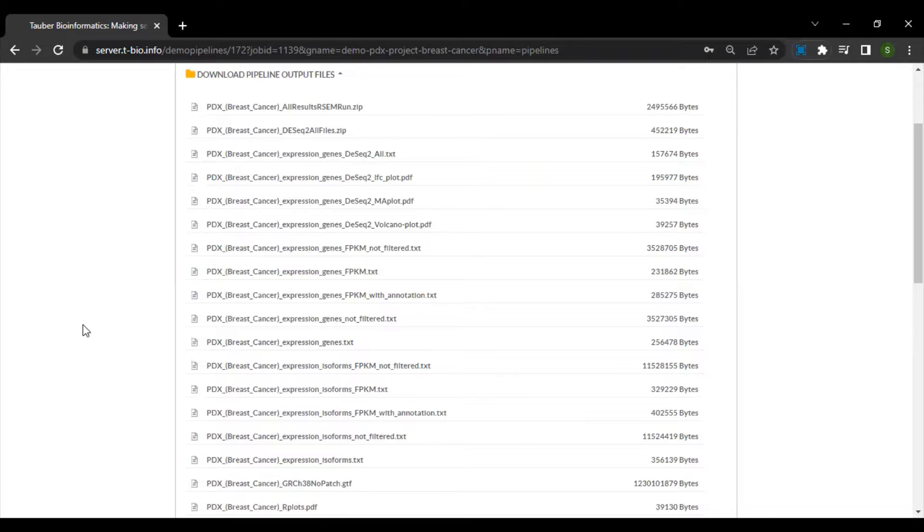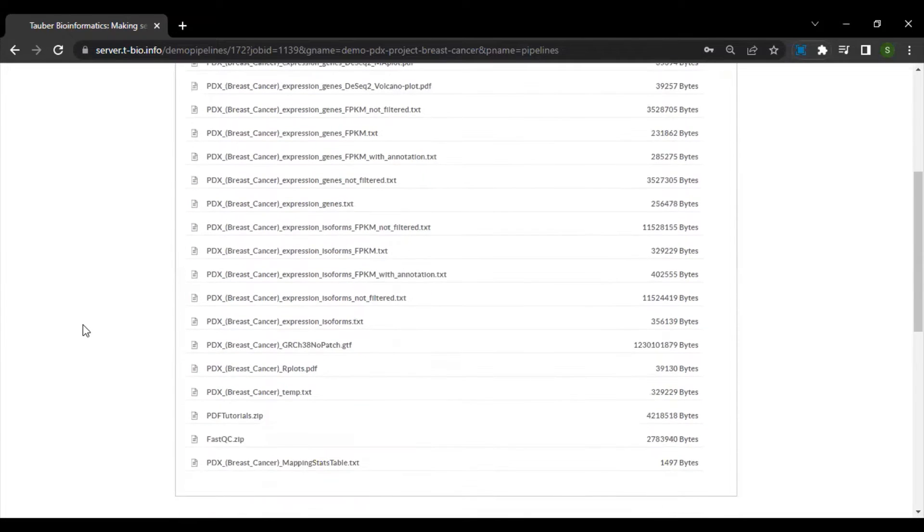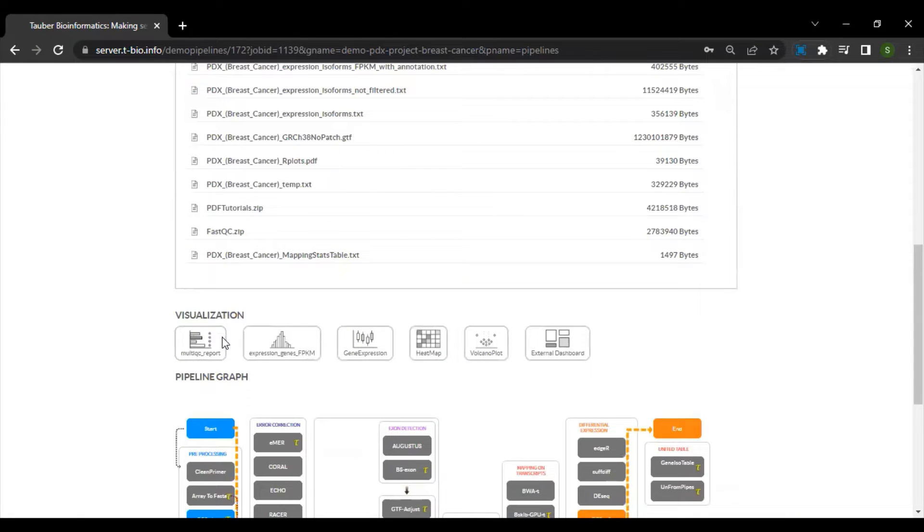Apart from that, you will also have several visualization plots, including MA plot and volcano plot. Now below, you will also see various visualization options.